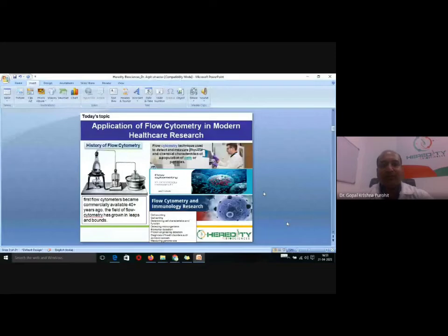Probably everyone attending this webinar has heard about flow cytometry. But the question is, what are its functions, and what is the relation between healthcare, disease diagnosis and research perspectives? Flow cytometry is a technique used to detect the physical and chemical characteristics of a population of cells or particles.